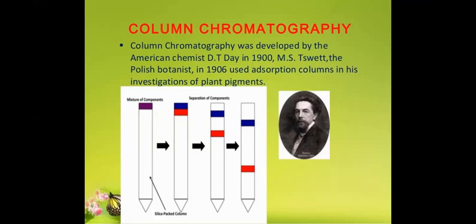As we know, in extracts of plants, many substances, many analytes, are colored ones. So it is very easy to identify the different constituents, different pigments, from the mixture of the plant extract.